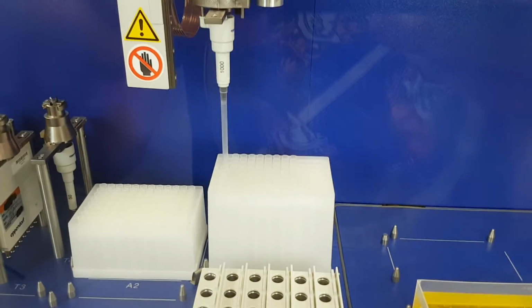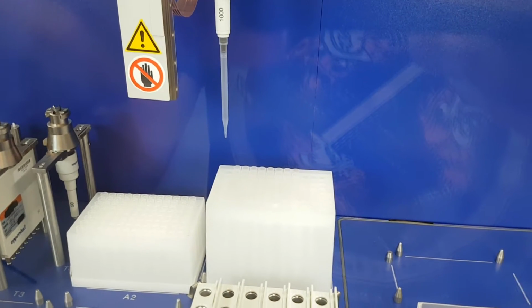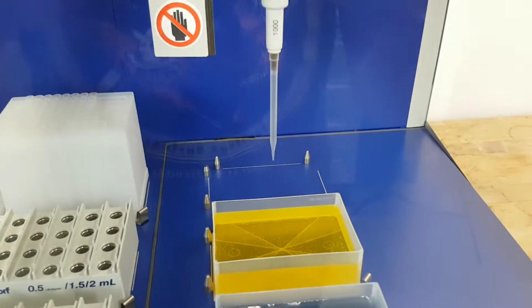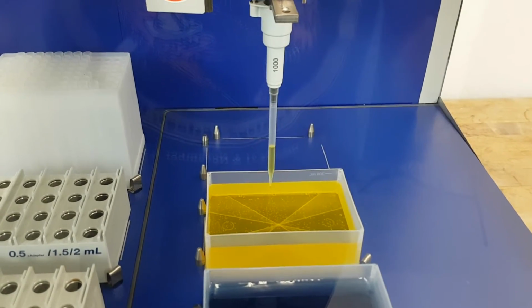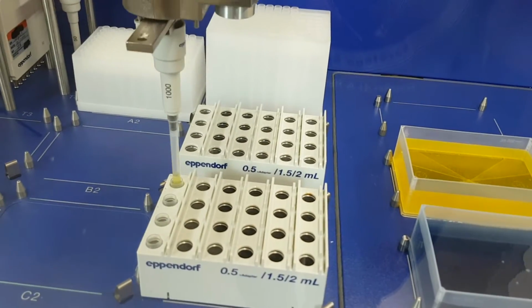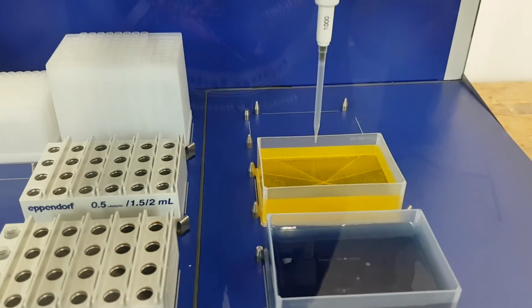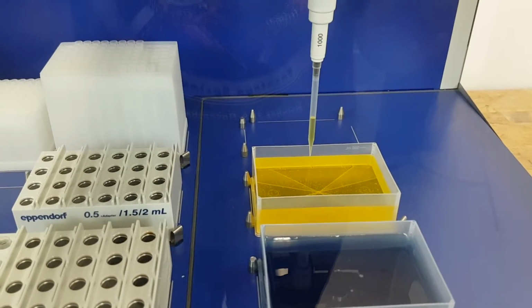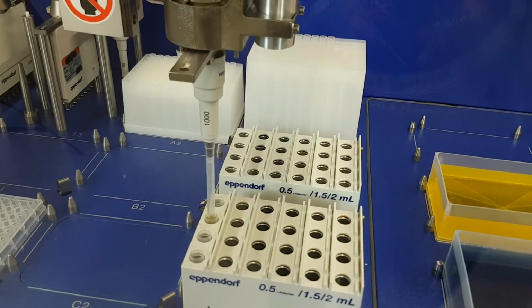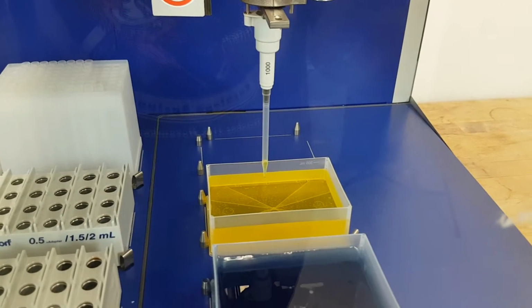And you see that it didn't pick the first pipette tip because that is empty, and it checked previously to know which location is the first one with a pipette tip that is available. I have instructed it not to change pipette tips during each command, so this will be reusing it, but you can instruct it to change pipette tips each time.